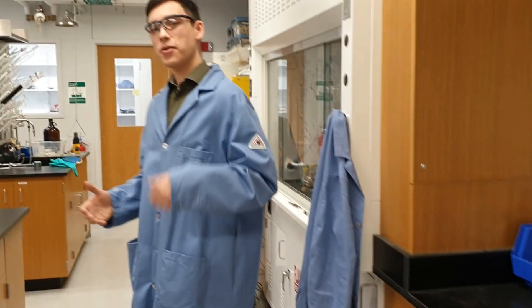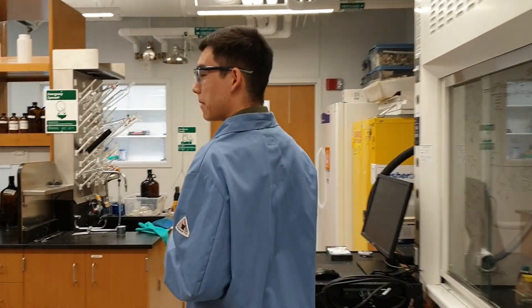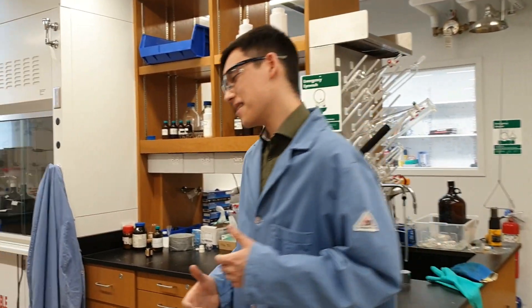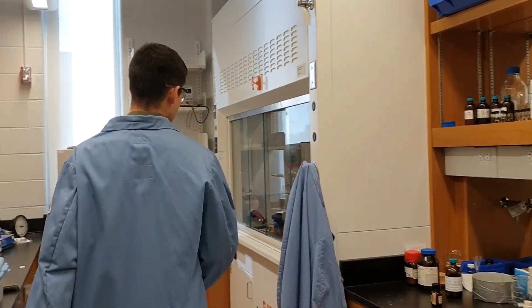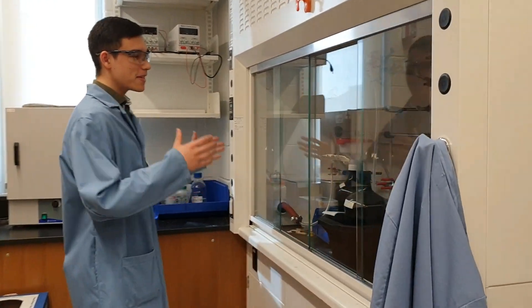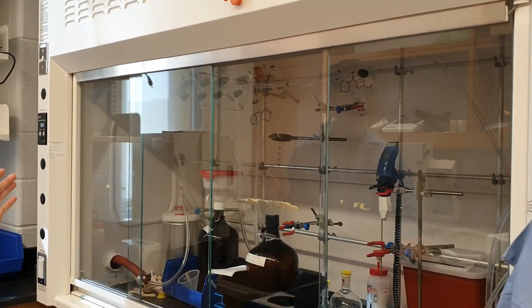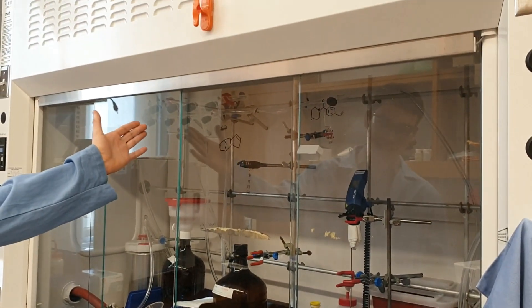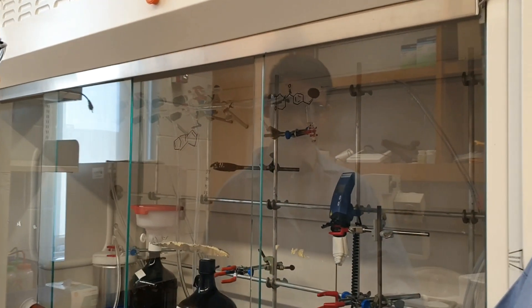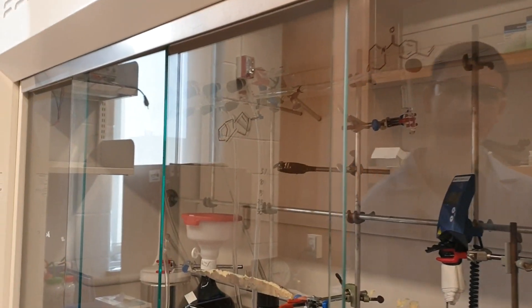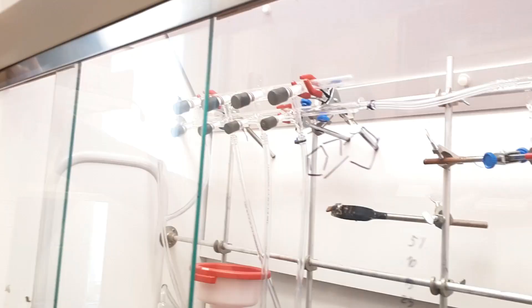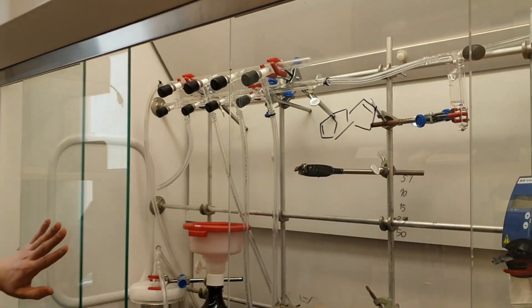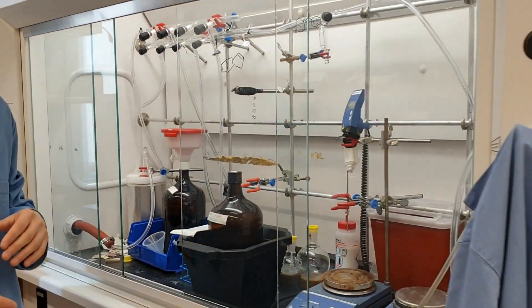Let's go ahead and show you one of the fume hoods you might be working at in the next upcoming years. As you see, everything in this fume hood, even though it's already been used, is very new and shiny. You get a really new schlenk line, a really clean bench, and a whole lot of space to work with and do your own chemistry.